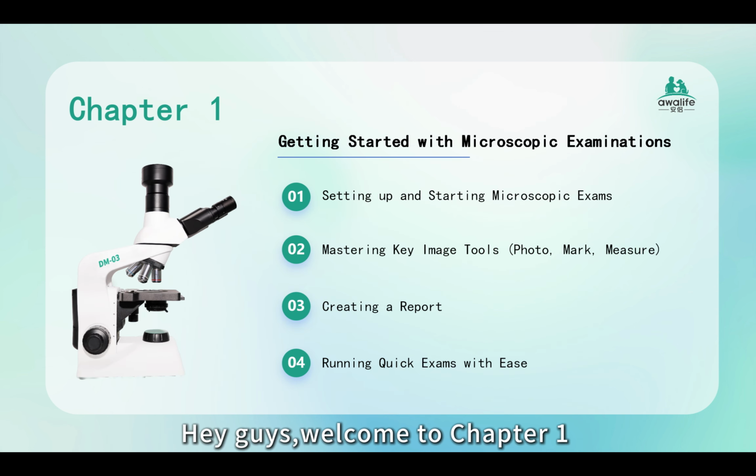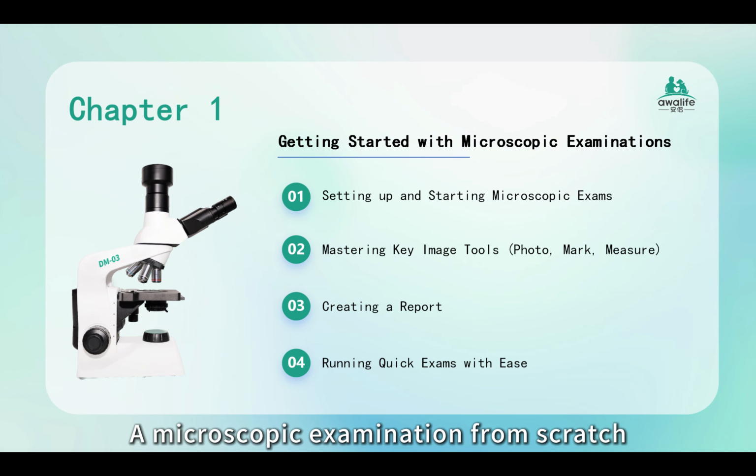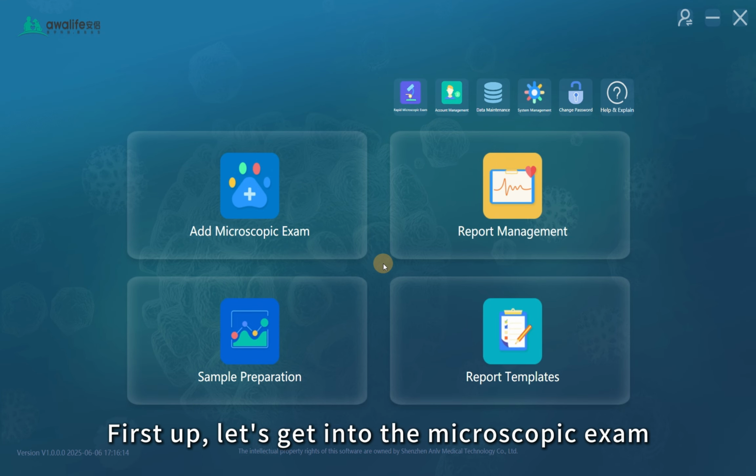Hey guys, welcome to chapter 1 on using the DM-03 Microscope Workstation software. In this chapter, we will walk through how to start a microscopy examination from scratch. By the end of this session, you will know how to create a patient profile, run inspections, use key image tools, and generate the report. Let's dive in. First up, let's get into the microscopy exam.